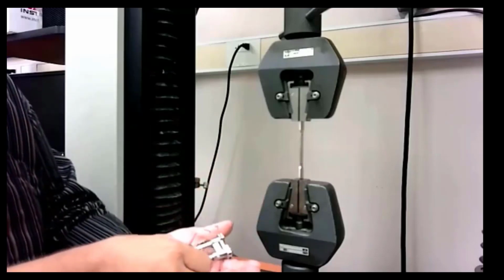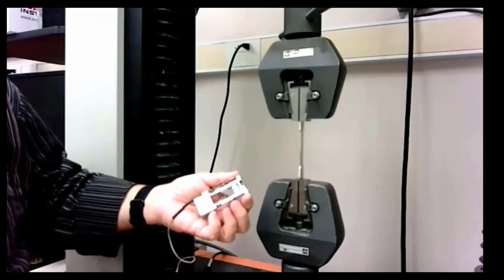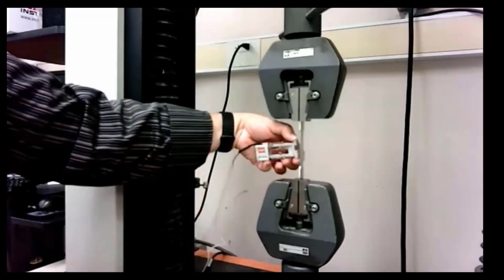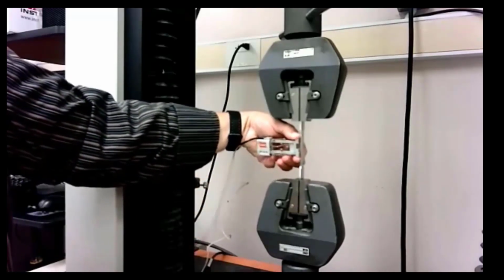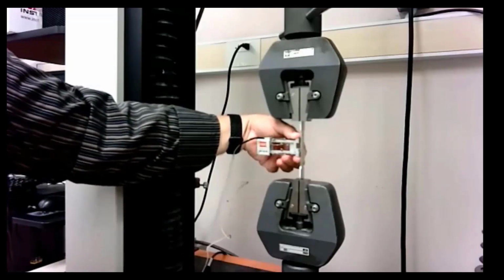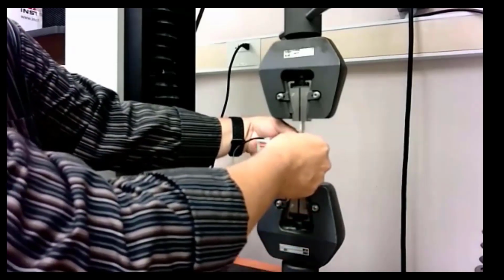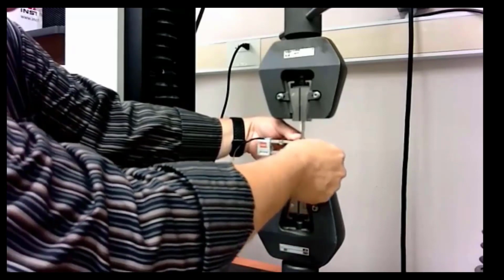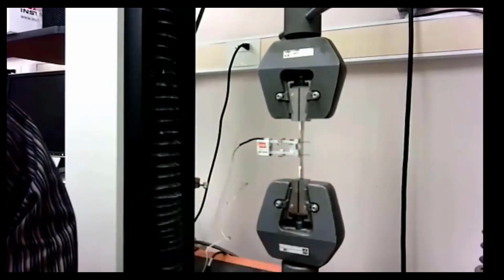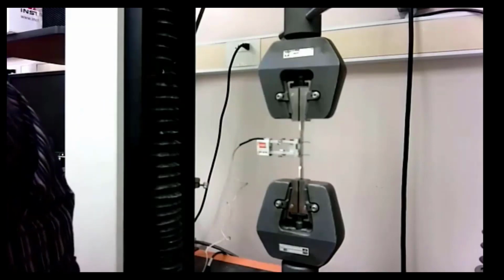The easiest way to install this is to lay it in your left palm and then squeeze the legs, the jaw, between your thumb and index finger at the very end. This allows you to hold it against the specimen where your fingers are going to be both holding the extensometer and touching the specimen. While I have it pressed gently against the specimen, I slip the springs into place. And the springs should have just a single point of contact between the spring and the specimen, and it should be opposite the feet.